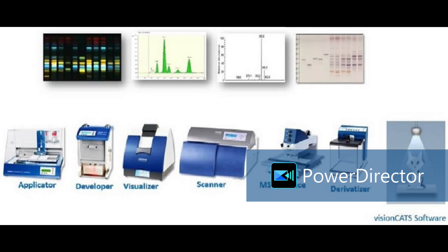That is one possibility. And we can do TLC-MS analysis also. We can elute and find out the molecular mass, or we can do derivatization and generate absorption spectra also, and by using spectra we can differentiate between designer drugs.